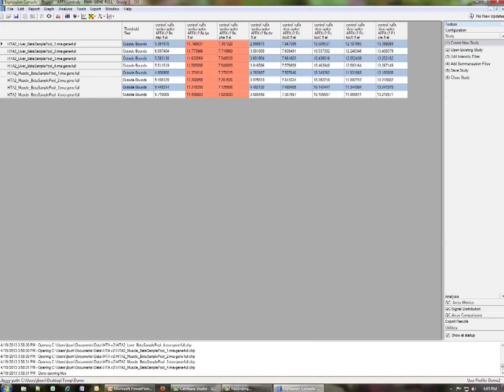So if this is going to be part of our routine process, we don't want this to always be showing up to call all of our arrays out of bounds because then we can't use any of the thresholds on other metrics. So how do we go about removing this?